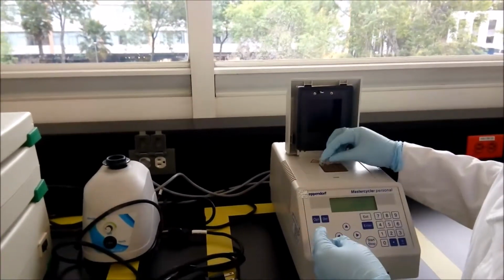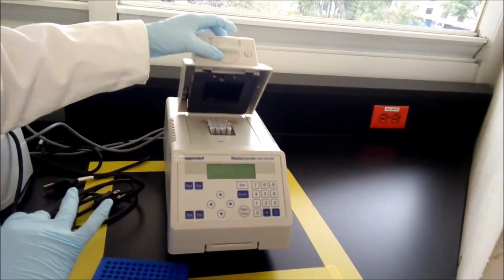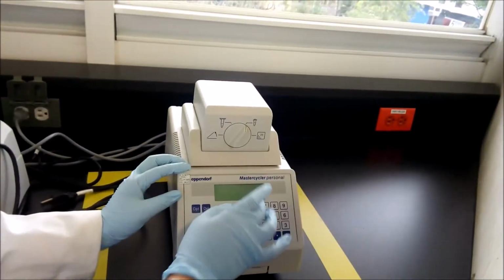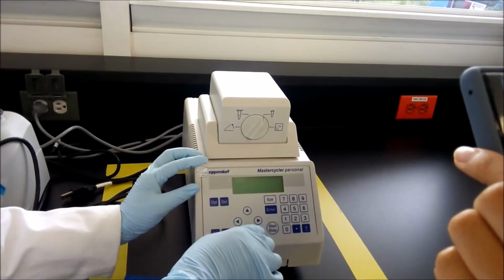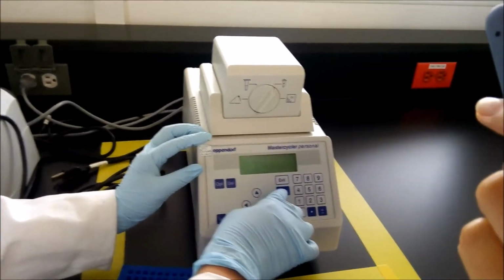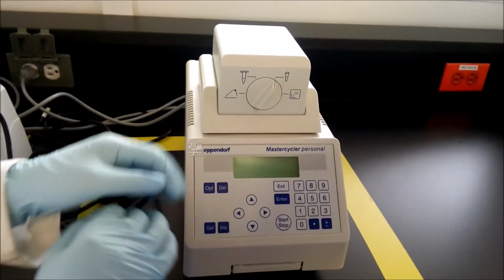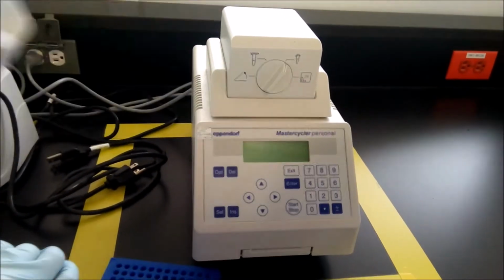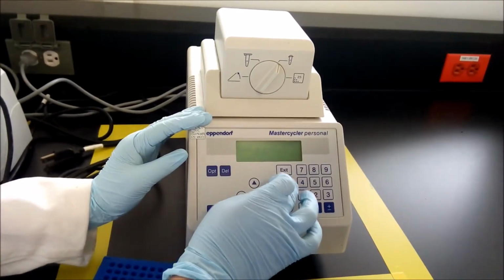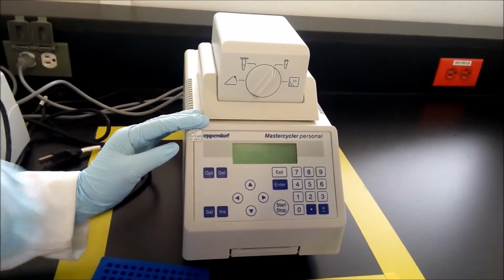Place the samples in the thermocycler to perform the PCR. Finally, the thermocycler is programmed. For this reaction, an initial denaturation temperature of 94 degrees Celsius was used for 5 minutes. Subsequently, 3 temperatures were programmed for the 30 cycles, with a denaturation temperature of 94 degrees Celsius for 30 seconds, an alignment temperature of 59 degrees Celsius for 30 seconds, and an amplification temperature of 72 degrees Celsius for 40 seconds.